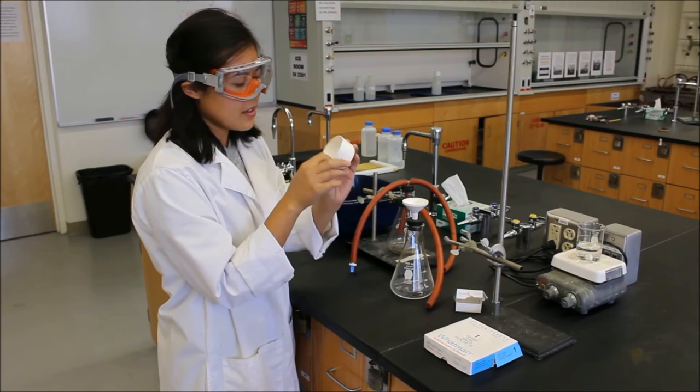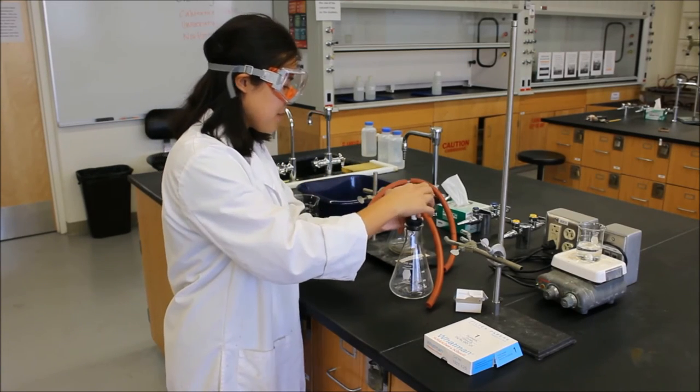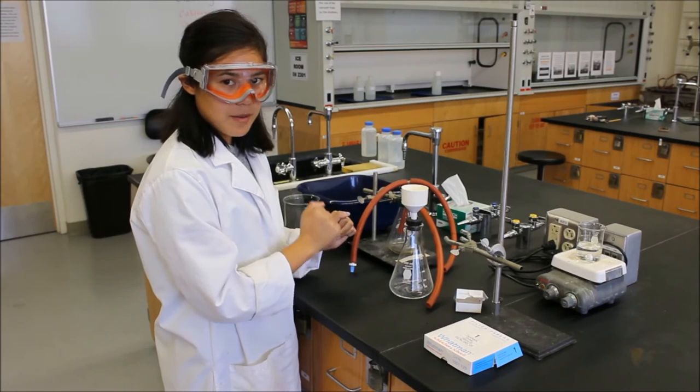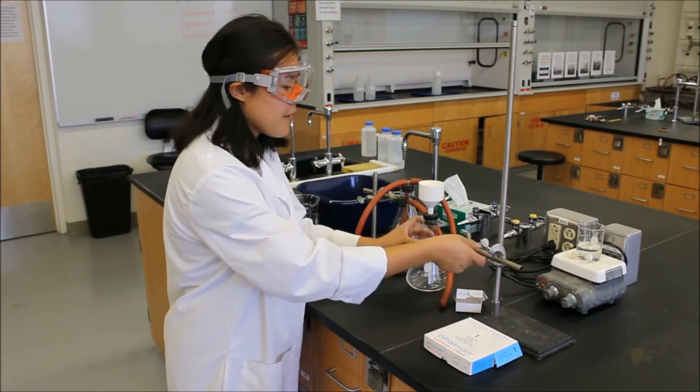You don't have to fold it or anything, just set it right inside, put it back on, and that's ready to go. So to set up the vacuum trap, there are a few things you need to do. First, I recommend that you get a clamp so that you can hold this flask down.